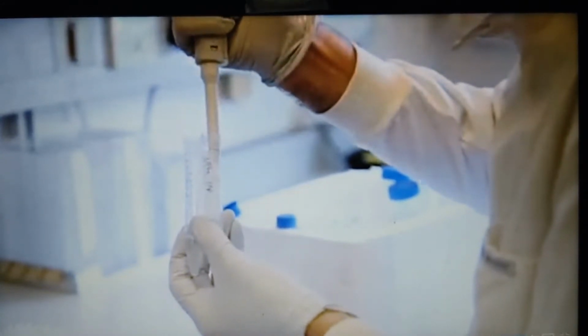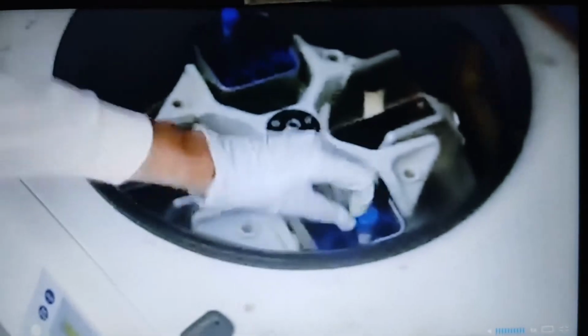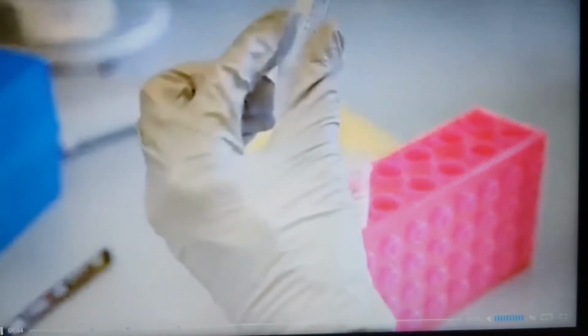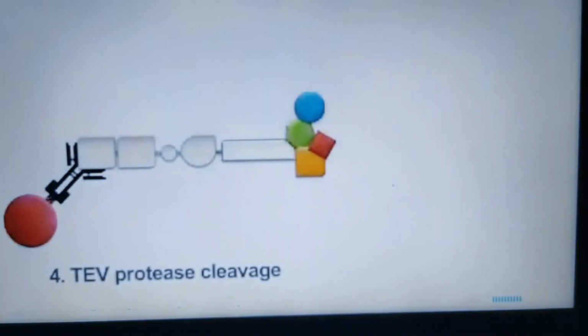After the final wash is complete, add the filtered and clarified lysate to the packed beads and incubate for 3 hours, or overnight if preferred, at 4 degrees C using a rotating mixer. Following the immunoprecipitation, spin down the agarose beads and remove the supernatant for subsequent analysis. If required, you can use a fine bore tip to remove any remaining liquid from this tube. This supernatant is sample 2.